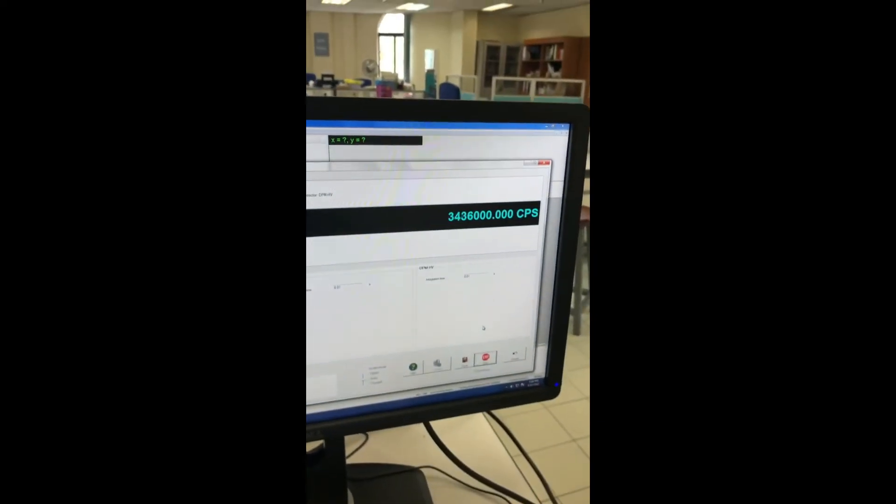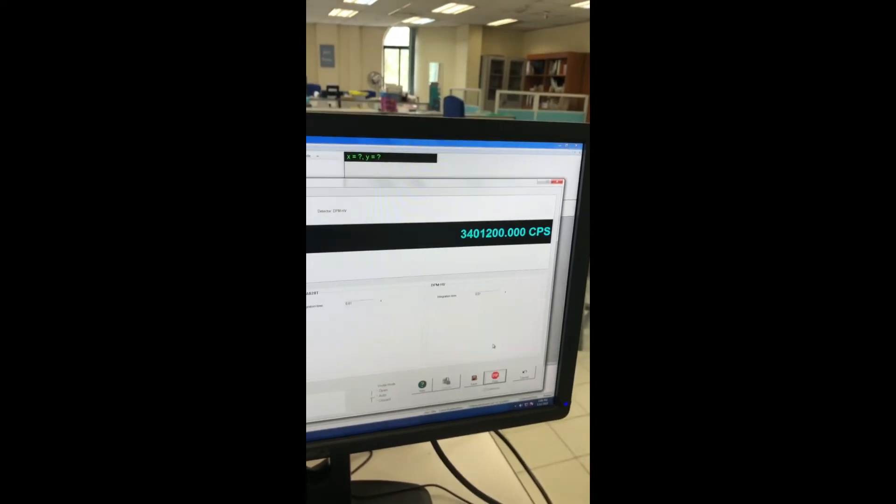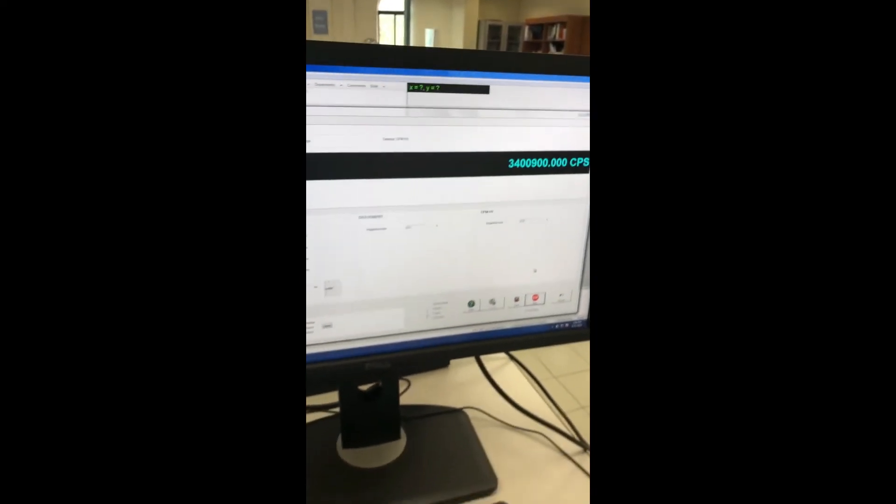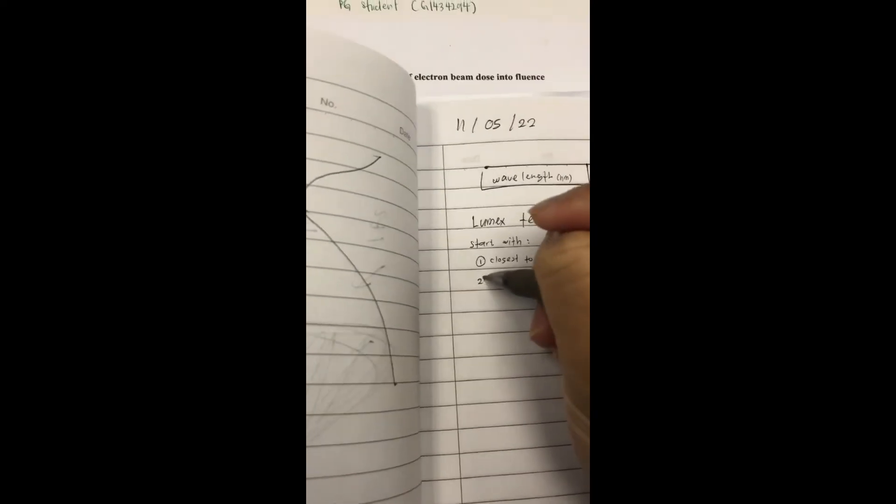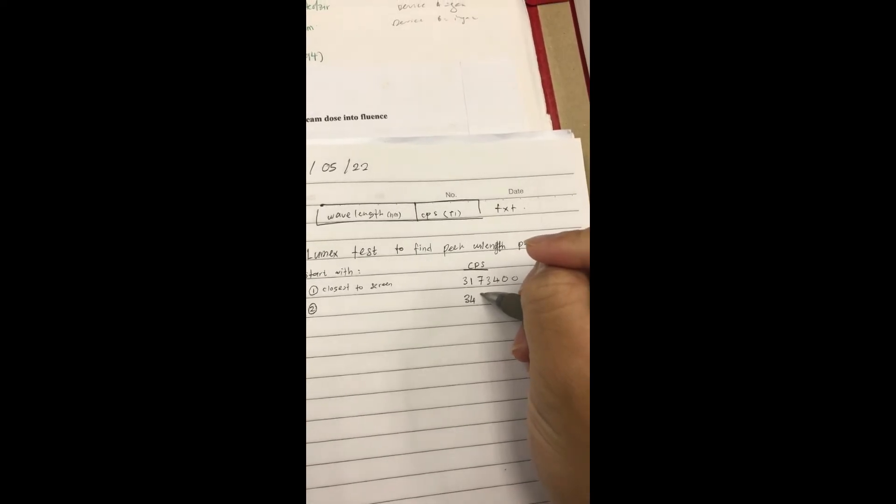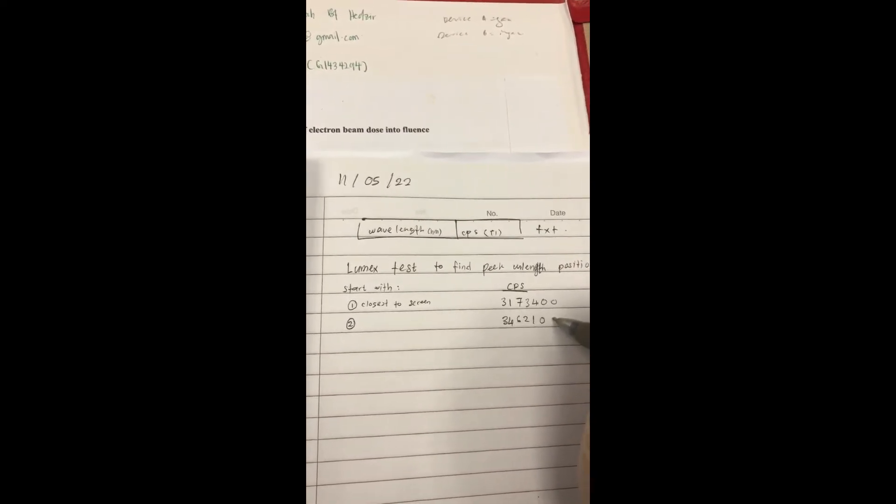You can see that the value of the CPS is going up. Next, jot down number two for the middle. We have around 346,210.00. So as you can see that the value is increasing.